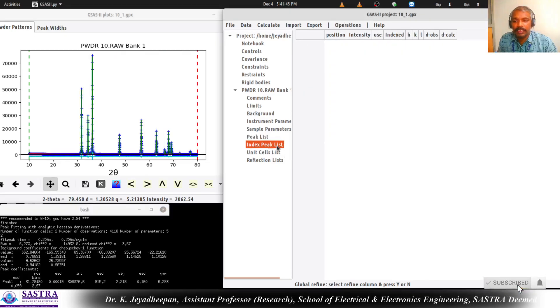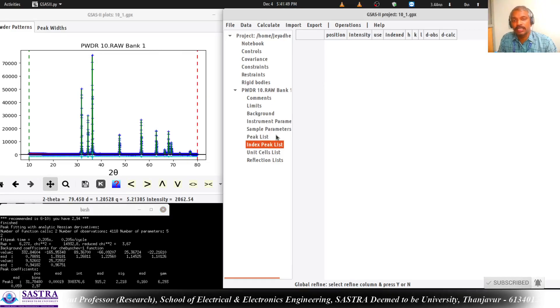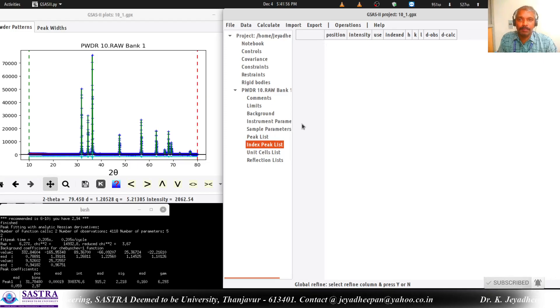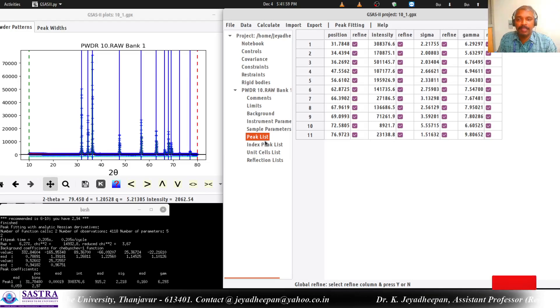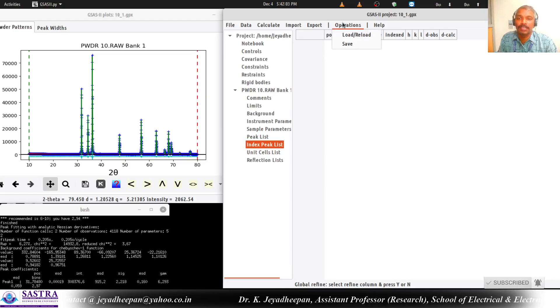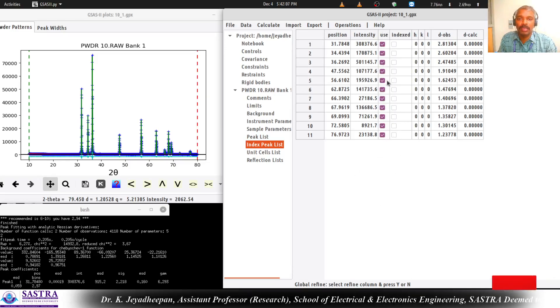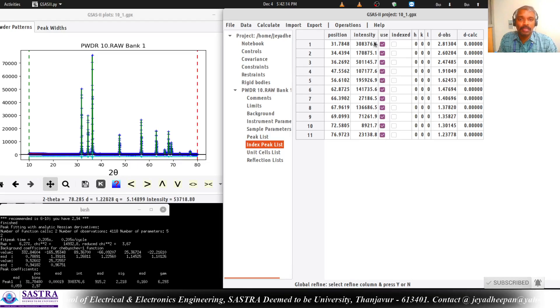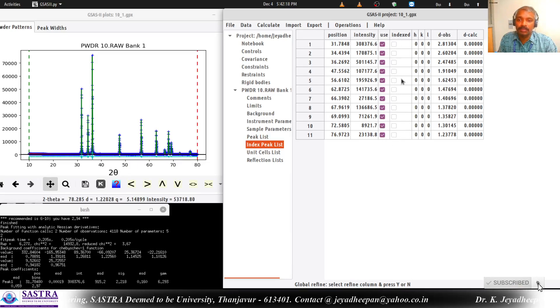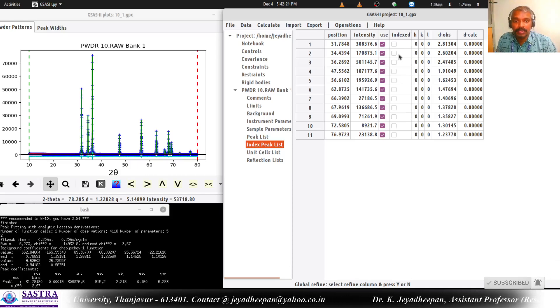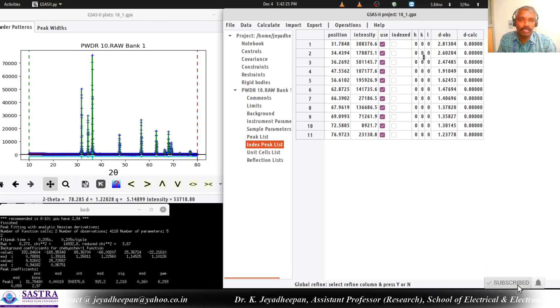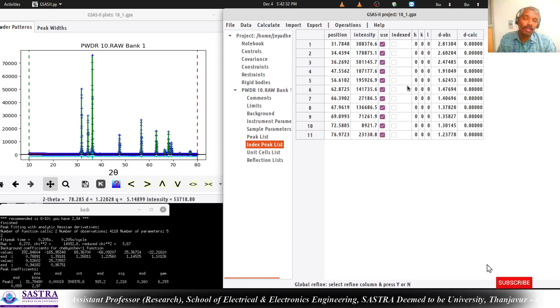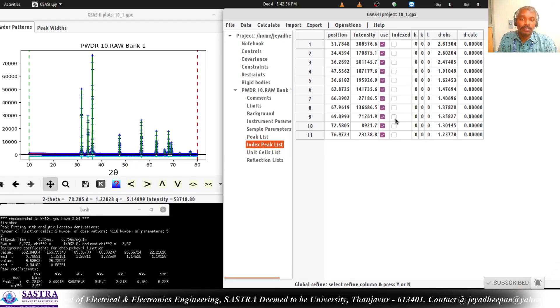In the next step we have the Index Peak List. Indexing the peak list means we have to assign the HKL values for the peaks. For that we need to import the peaks - the peak list we generated should be called here in this window. Go to Operations and press the Load/Reload button. You will have all the peaks listed. We are going to use all the peaks and refine all the peaks and index all the peaks. At the initial stage you can see that HKL has no values - all the HKLs are zero. After the indexing step, HKL values will be assigned automatically.